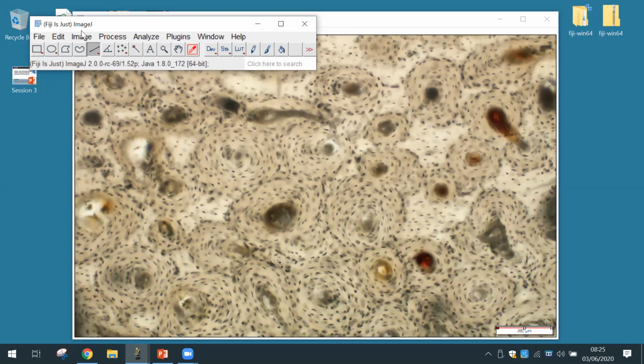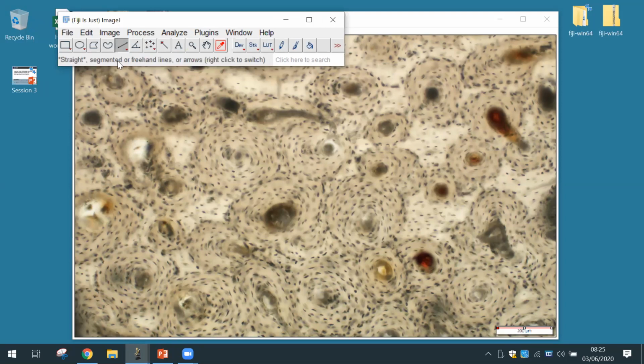But for the area itself, for Haversian canals and osteon area, you can really do two things. In the literature, people who report the use of ImageJ report two different tools. Some labs use the freehand selection, and some labs use the polygon selection. For me and my students, it really is a matter of preference. I personally prefer the polygon selection, and I'll demonstrate in a second why.